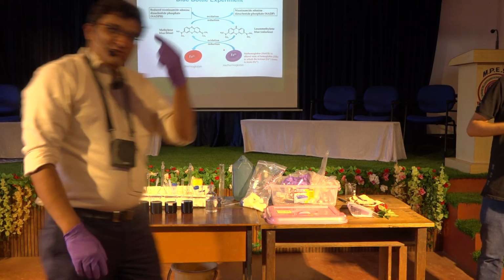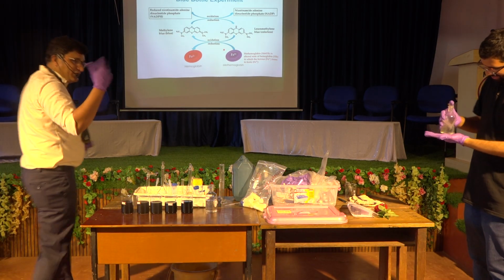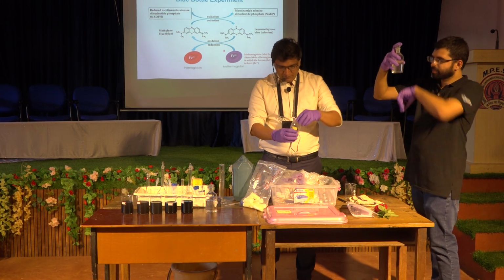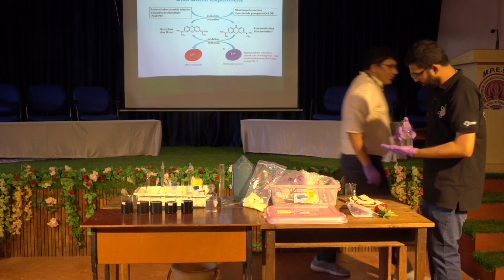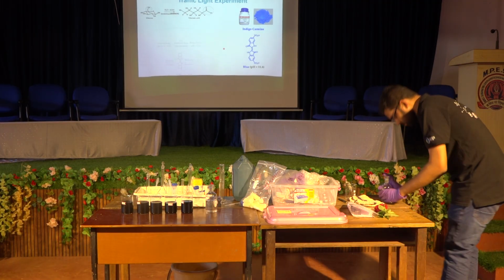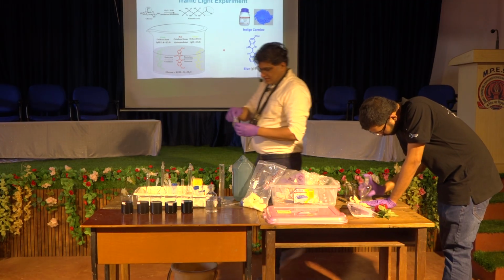Okay, so that was one color. Now Atul has a dye which shows basically three different colors. There's another dye called indigo carmine, which is again blue in color.